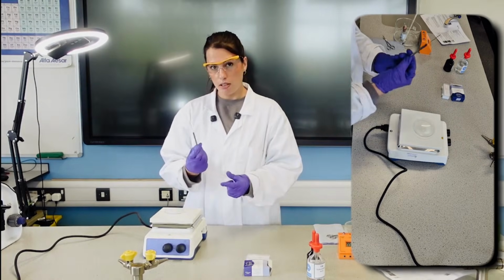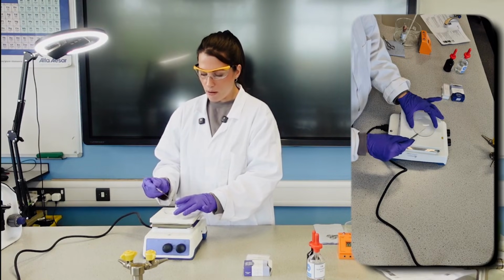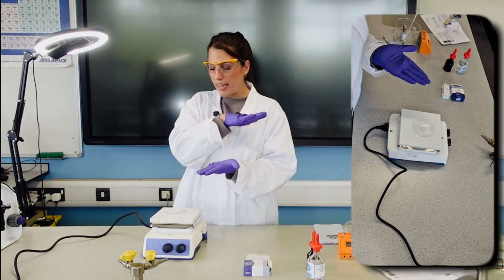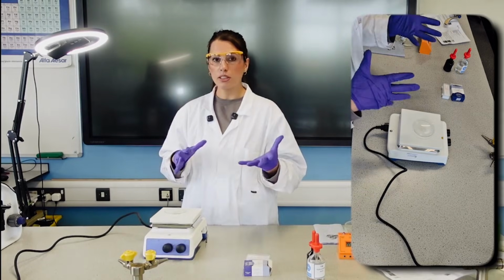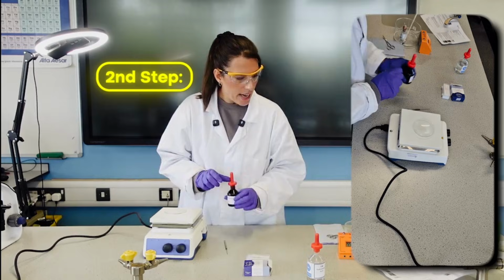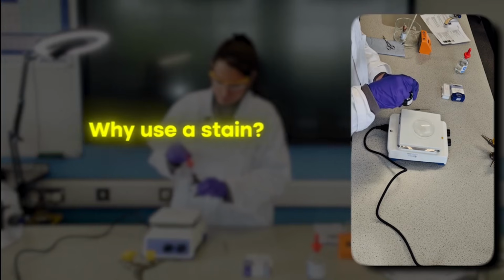I also used the mounted needle to help macerate it, and all of this is to help break down the cells that are connected, so when we come to squash it, we do get a single layer of cells so that light can pass through and we'll be able to visualize the results. Acid is also there to stop mitosis, as we talked about earlier on in the video. So the next step then is I'm going to add some stain to this while it is heating as well.